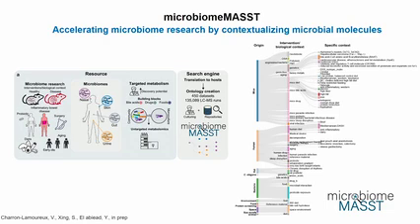You have a lot here from the mice. You have different types of infections. You can have viral infection, parasite infection, bacterial infection, different diet studies in humans that are already embedded here, and we have different surgeries that have been performed where we have collected data, and so on. So there's a lot more information that's going to be embedded into Microbiome Mass.